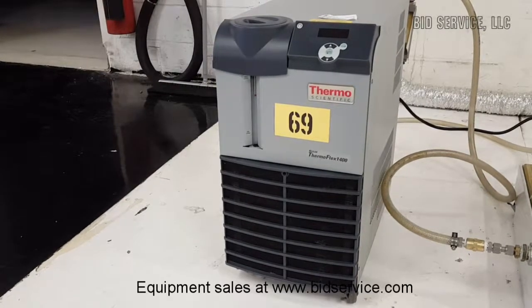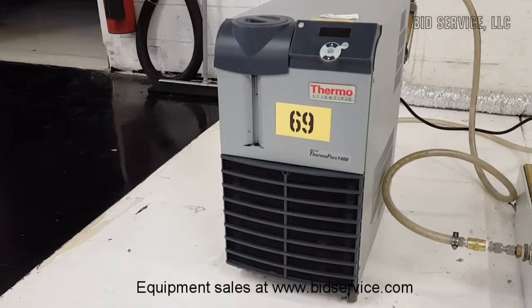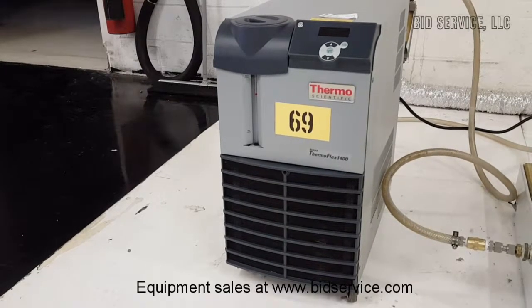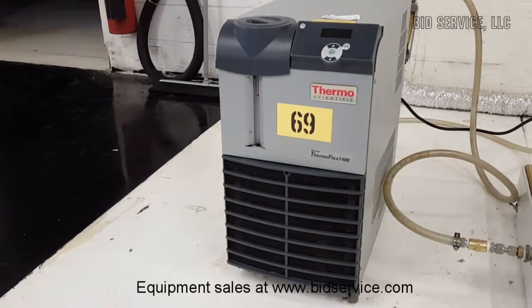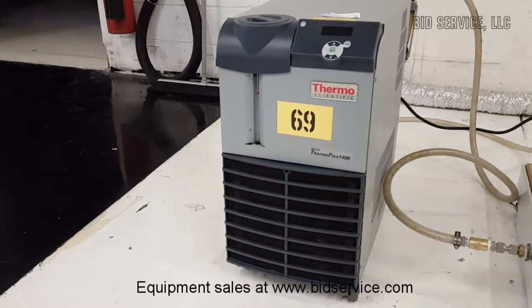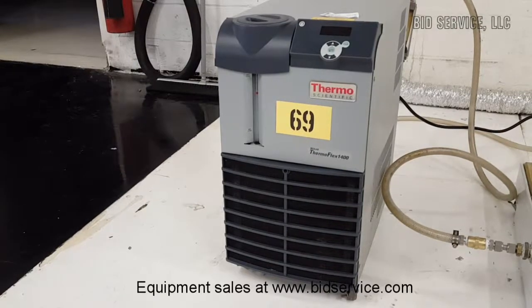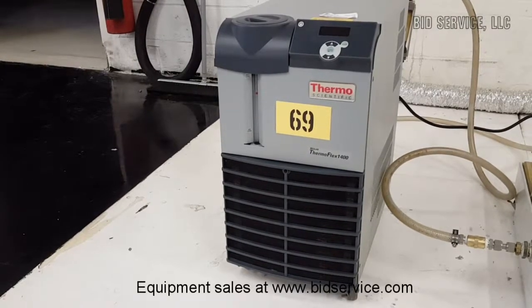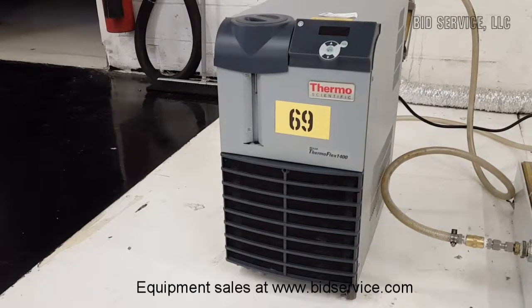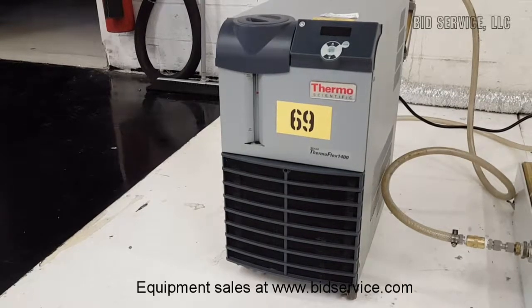This is the Nest Lab ThermoFlex 1400 recirculating chiller. It has an air-cooled refrigeration system and a digital controller with a user interface. It has a temperature range of plus 5 degrees to plus 40 degrees C. It has a cooling capacity at 20 degrees C with a 60 hertz system of 1400 watts, and a positive displacement of 4.1 gallons per minute at 60 PSI.